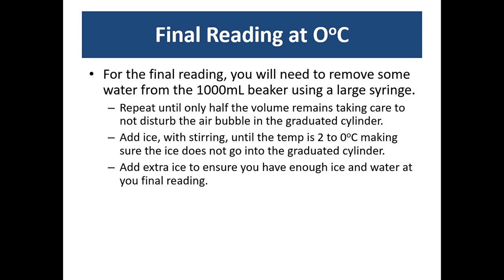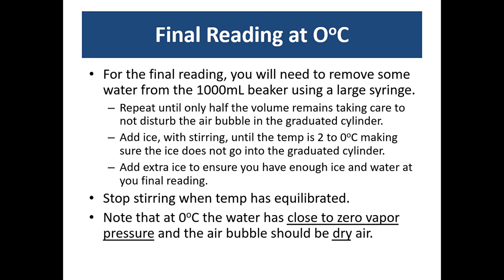Add enough extra ice to make sure that the water level is again higher and that your bubble is sort of submerged inside water although at this point you have water and ice. Once the temperature has settled somewhere between zero and two degrees Celsius you can stop stirring and at that point you can slide up your graduate cylinder and take your final volume reading. The important thing about this data point is that at zero degrees the water should have close to zero vapor pressure which means that the air bubble you have in there is all dry air. We're going to need this to make some of the calculations as we adjust the pressures of the air bubble at different temperatures so we can subtract the pressure contribution of the dry air and we can focus exclusively on the vapor pressure of water at the higher temperatures.